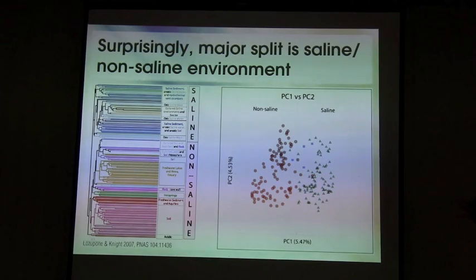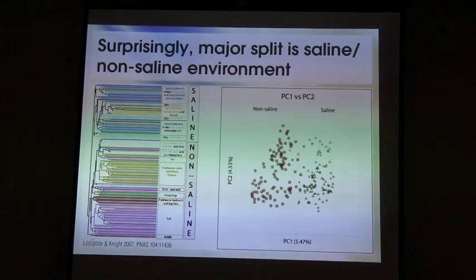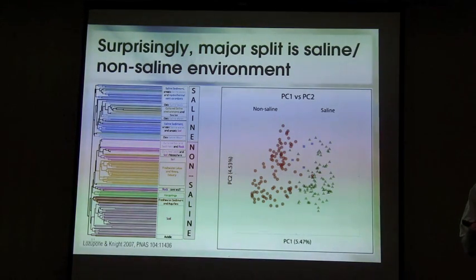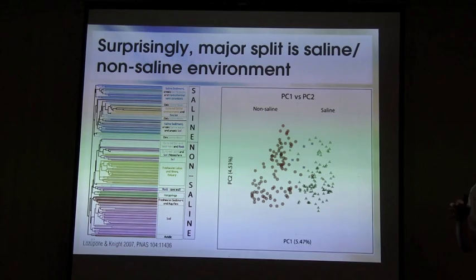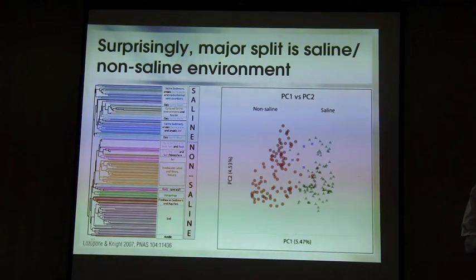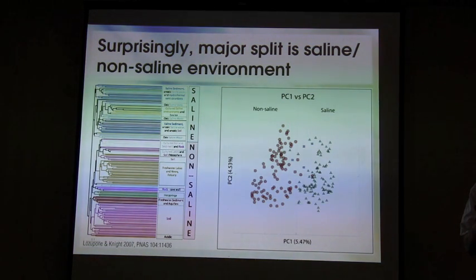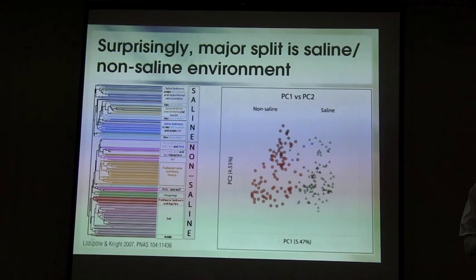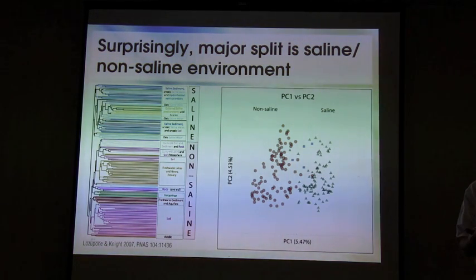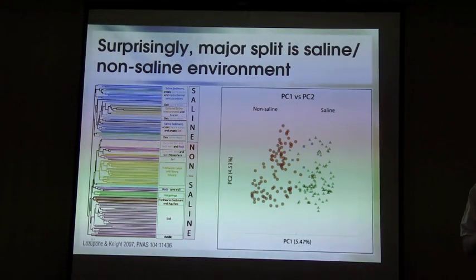However, doing this meta-analysis was a complete disaster in terms of metadata. So you'll notice that these are very broad categories. Initially, Kathy was planning to enter the actual pH, the actual temperature, a whole lot of other variables for each environment, but it's essentially impossible to get these out of the literature after the fact, and the amount of work involved is tremendous, which is why we place such an emphasis on getting the metadata into a consistent format so that you can do these kinds of things with the click of a button, instead of, as Kathy did, spending several years reading 400 different papers to find 110 of them that actually had useful information.